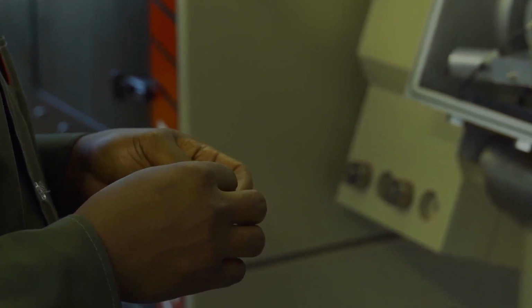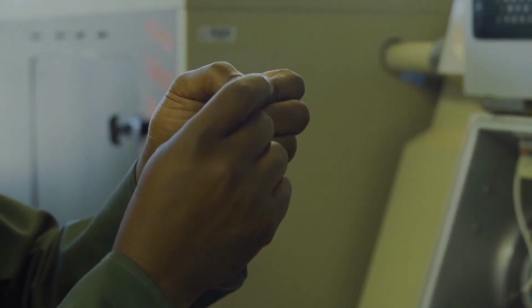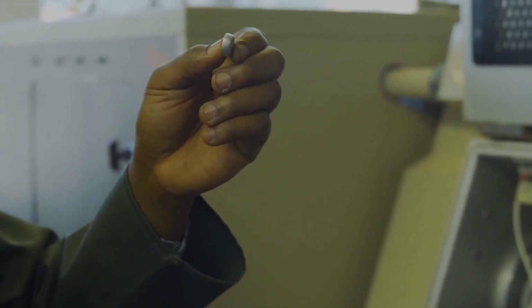But one more interesting thing to show you would be the results. How do we know if we've achieved what we wanted to achieve? We need to check on the computer. And I will show you a quick check that you need to do on the computer so that you can be sure whether to accept the result or to repeat the experiment. Also, you can also check by calculating what is called barreling coefficient. You need to check the Gleeble application notes on how to do that.